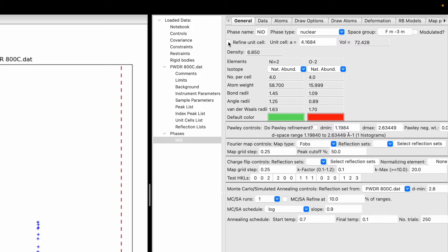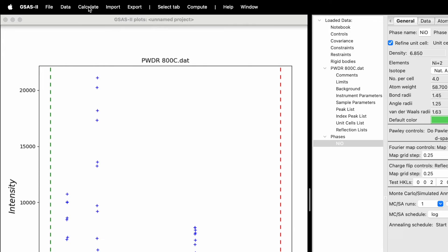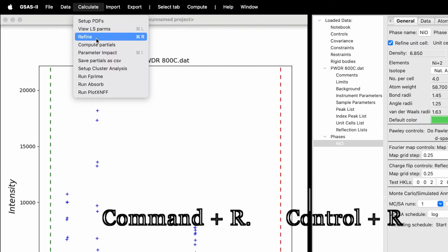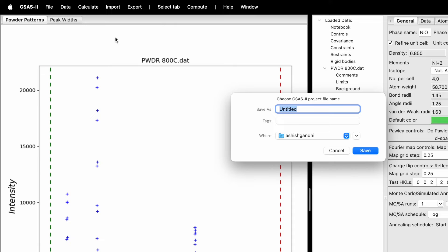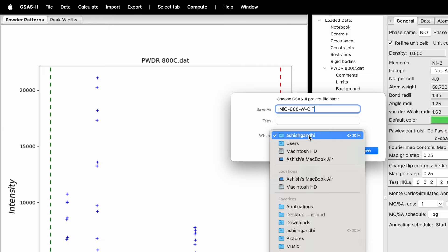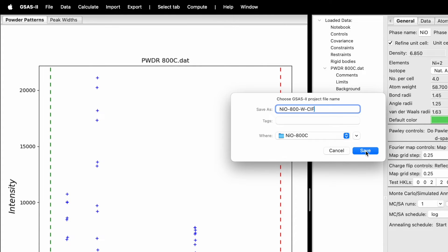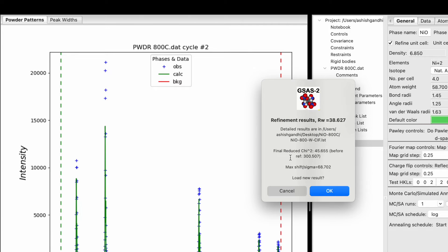Come back to General, click Refine, then click Calculate. Here you will see the option to refine. On Mac you can use the shortcut Command+R, and on Windows it is Control+R. Click Refine. It will ask you to choose a GSAS-II project file name — the file name is NiO_800 without CIF. Save it. Now it will begin to refine. Initially the reduced chi-square is 45, which is pretty high. We need to refine so that the chi-square gets below 5. Click OK.